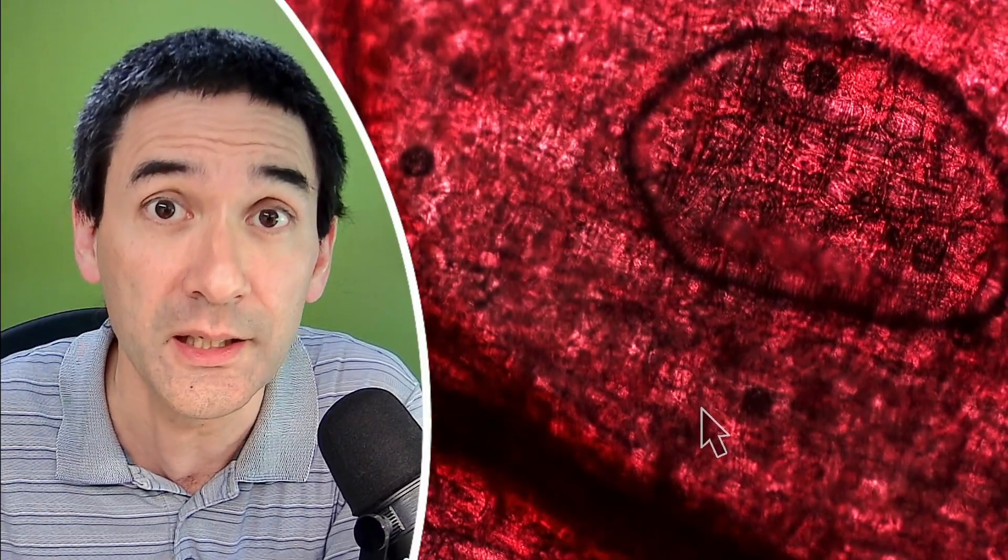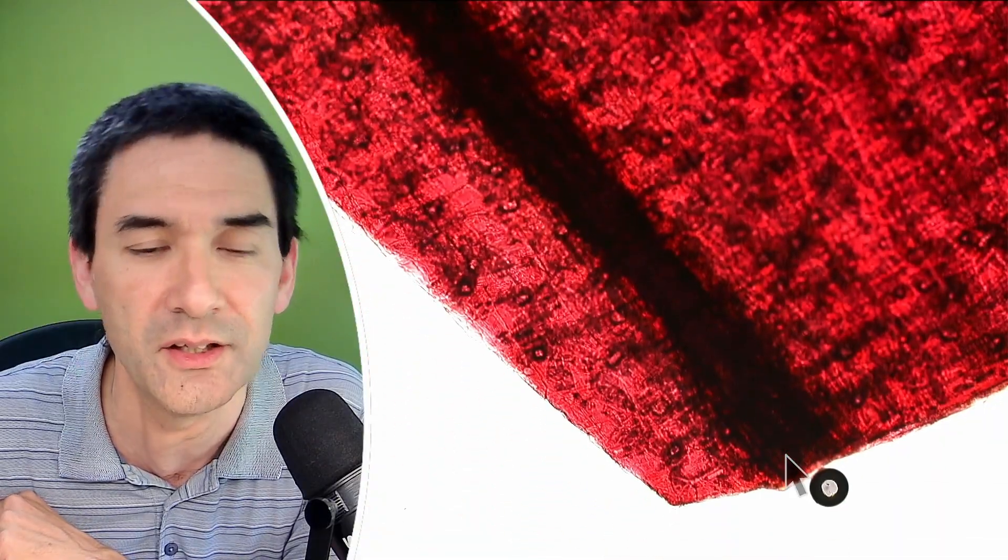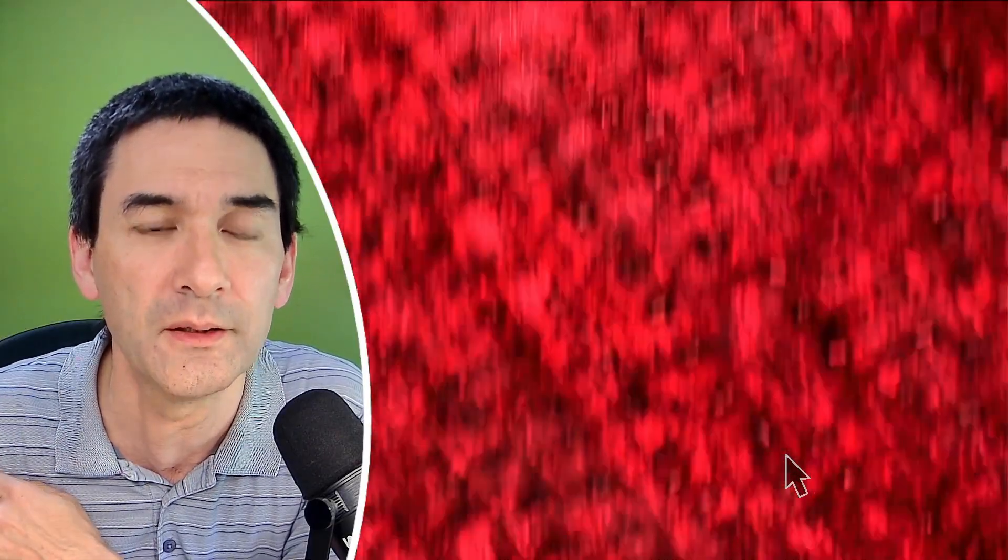Now let's have a look at how the onion skin in oil looks like. So this is now how it looks in oil. I have to refocus again. And I think that, as you can see, it looks much, under quotation marks, cleaner a little bit. The crystals are still quite nicely visible. But if you just move around, you see that I don't see any air bubbles. And again, the reason is because the skin of the onion, here there is a tiny one over here, the skin of the onion seems to reject water. And therefore, in some circumstances, oil might indeed be the better choice of a medium.